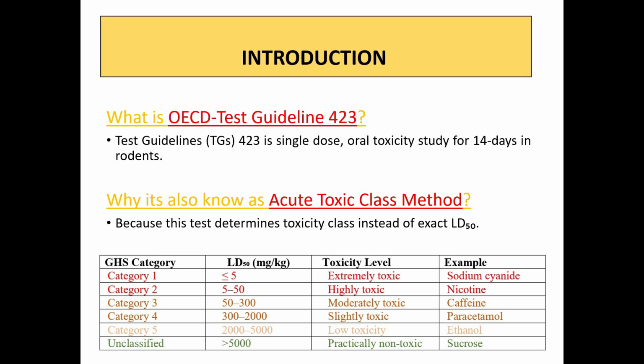In this experiment, generally for any chemical we take 3 animals, and you have to calculate the dose as per their body weight, and give the drug to only one animal first, and then if the animal is not dying, you go on to another animal. Likewise you do the experiment step by step. After dosing you have to observe for up to 14 days.